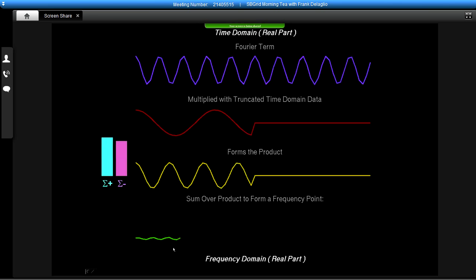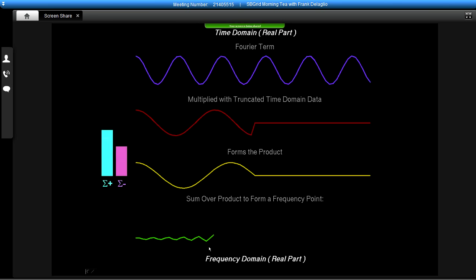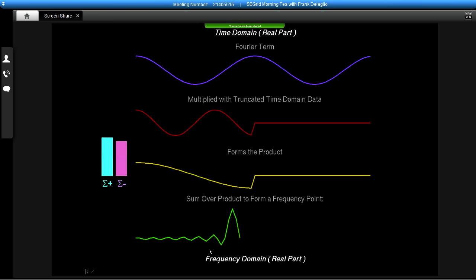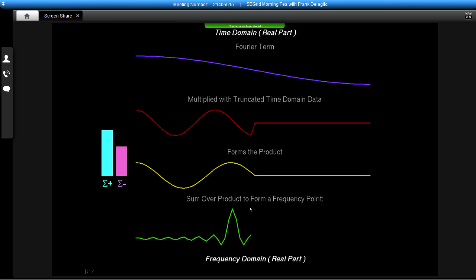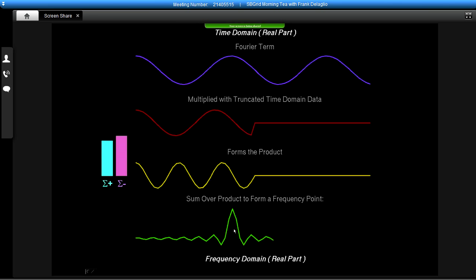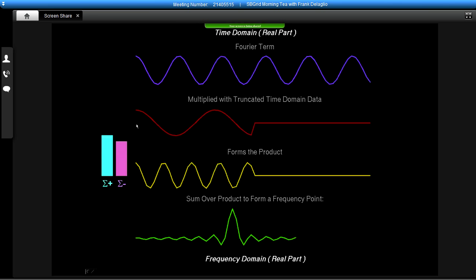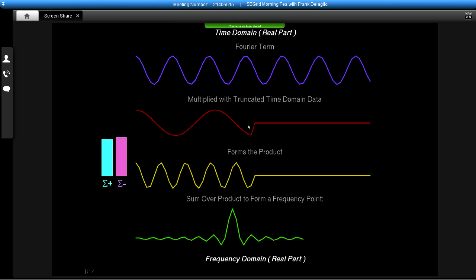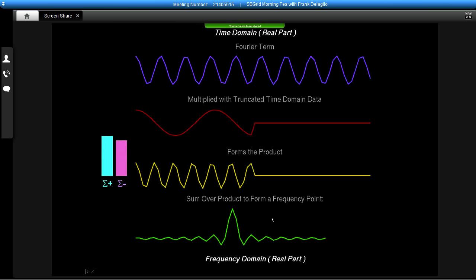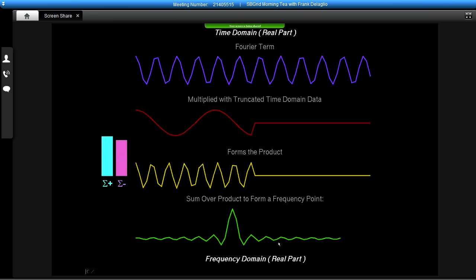And so the result is that we get a corresponding spectrum that has these very large regular truncation artifacts, these truncation wiggles, and the corresponding signal is very broad. And this is ironic because in this case, there's no decay in the signal and no noise. But nevertheless, we get a broad signal and these large truncation artifacts. That's a problem.